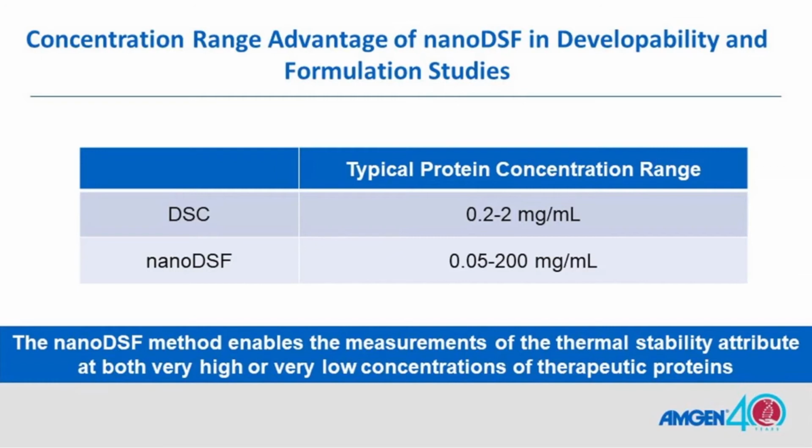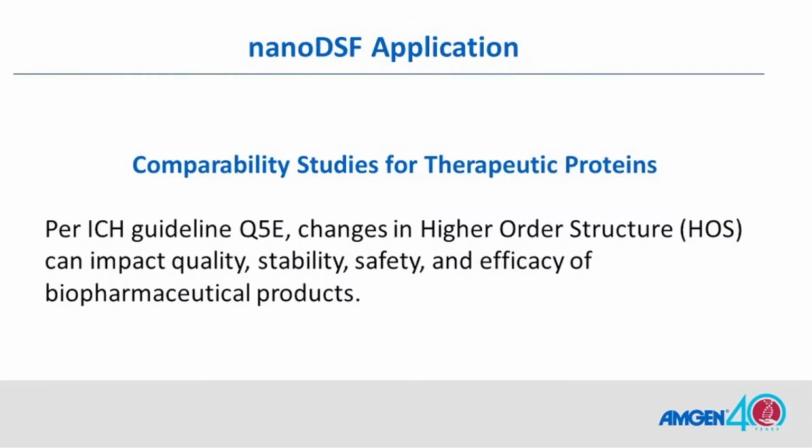The nanoDSF method enables the measurement of the thermostability attribute at both very high and very low concentrations of therapeutic proteins.